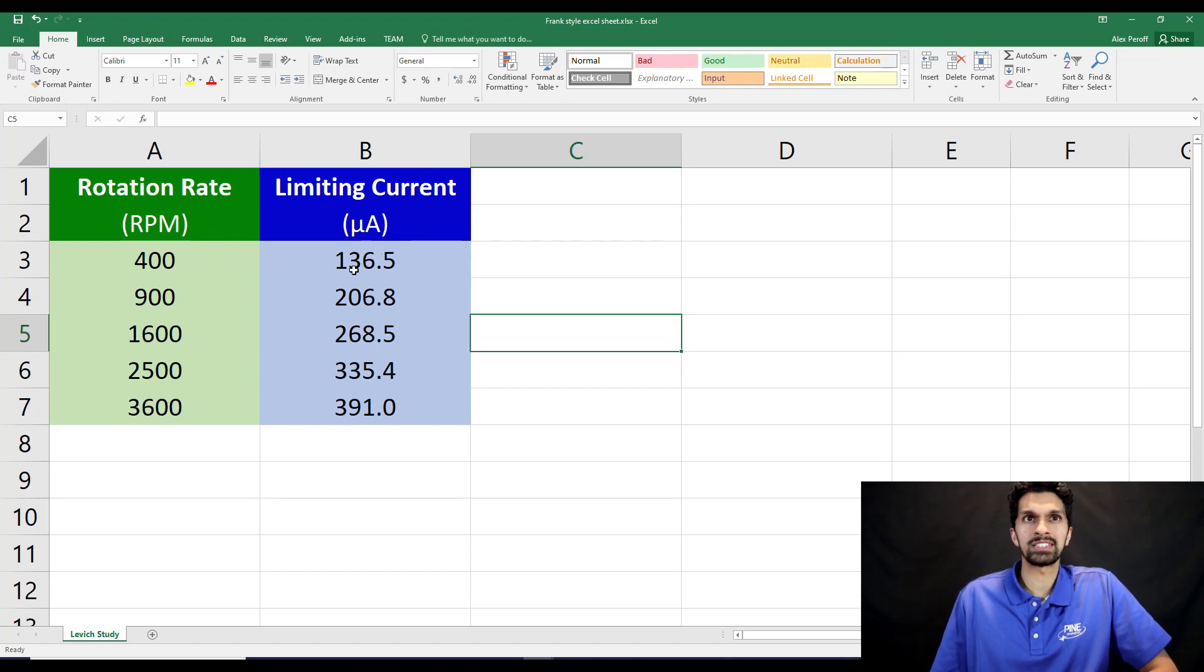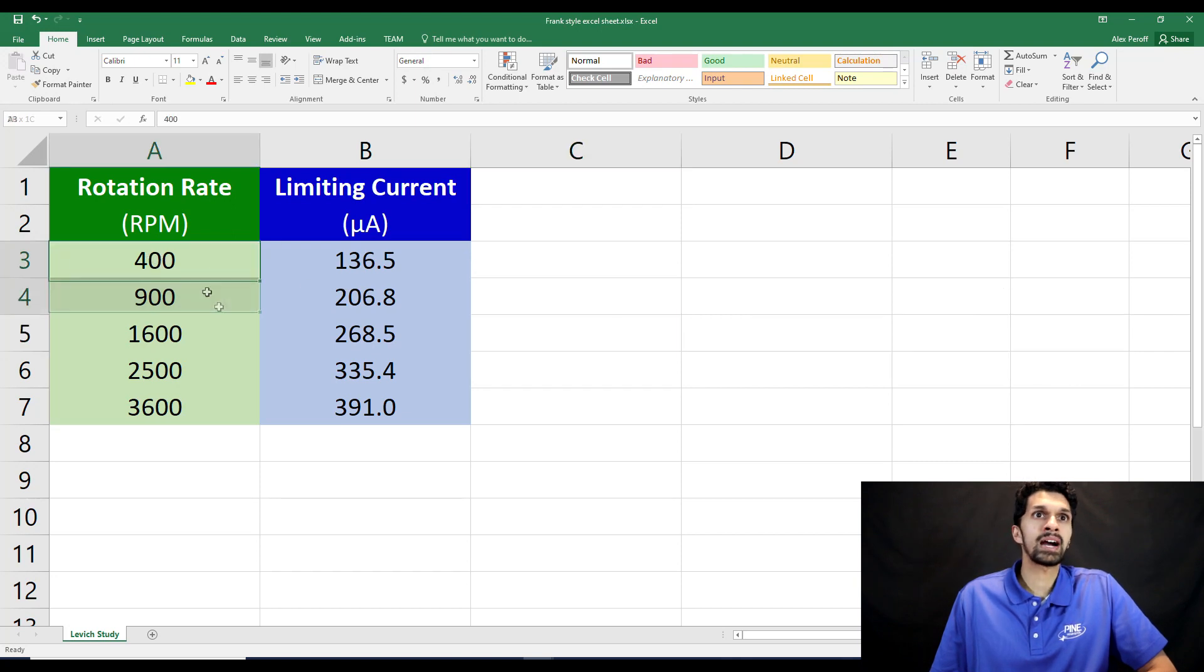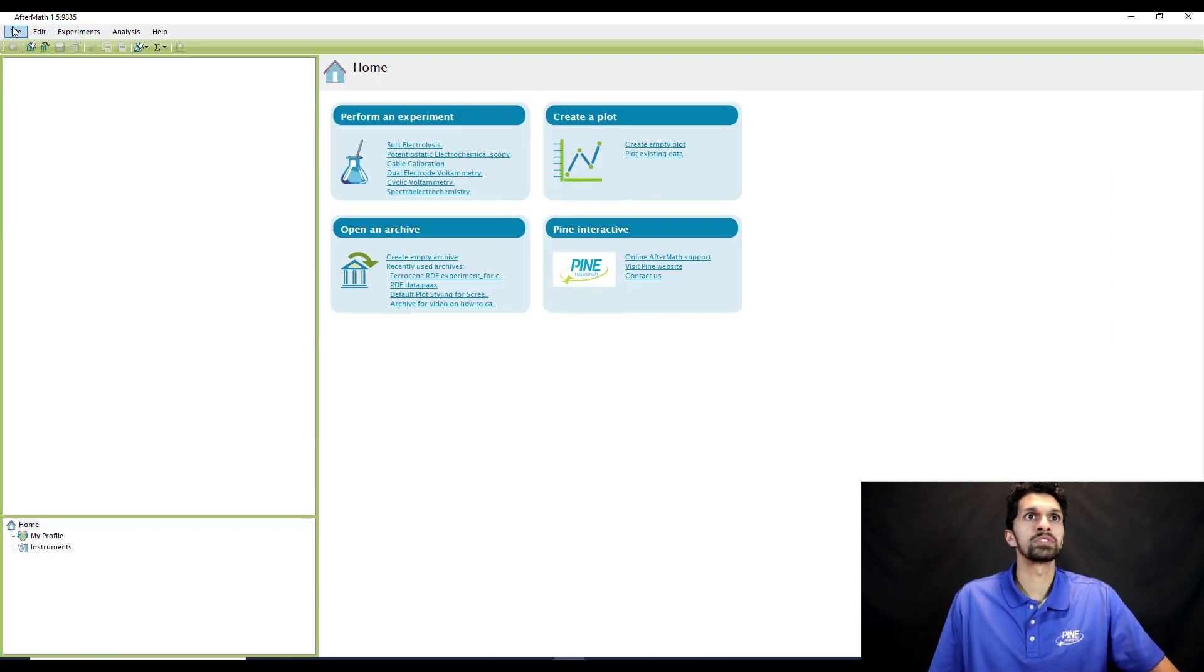Now, I could use Excel in order to do the data analysis, but I want to use Aftermath because it's going to make things a lot easier. So I can actually copy these points, just hit ctrl C. So I'm in Aftermath. I'm going to create a new archive.